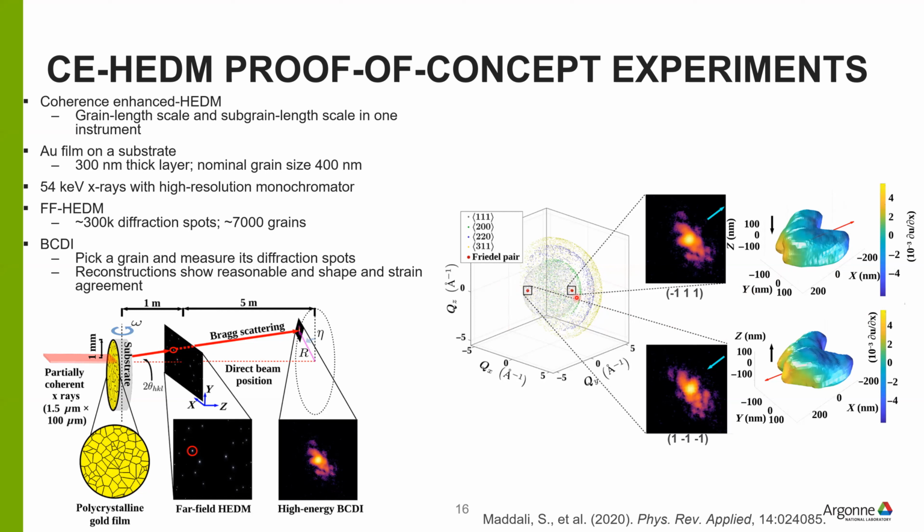So this is a quite exciting development, and we want to make this more streamlined so that this becomes a more routine tool as we zoom in and as we develop this HEXM beamline where we can do a zoom in and a zoom out, so that the mesoscale measurement and the nanoscale measurements.